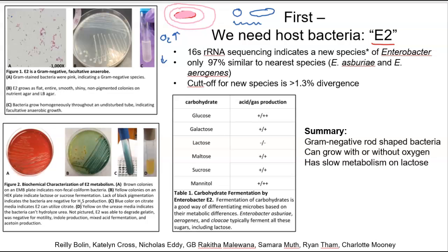Alright, so this is part 3 of 3. Now that we have a host, we've got E2 bacteria, let's find something that eats it. Let's find a phage that infects E2.